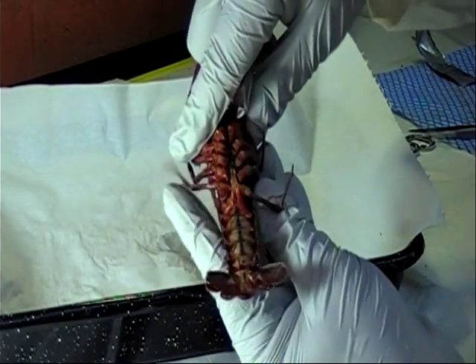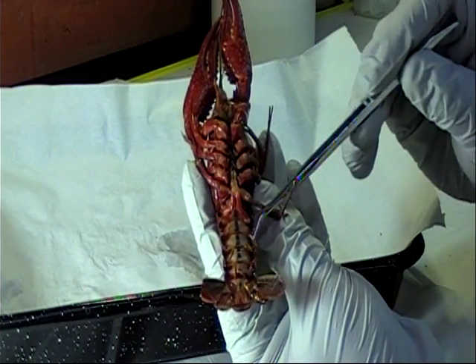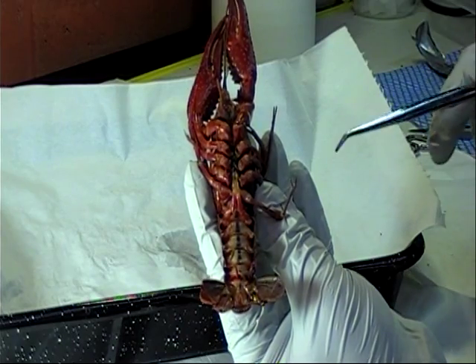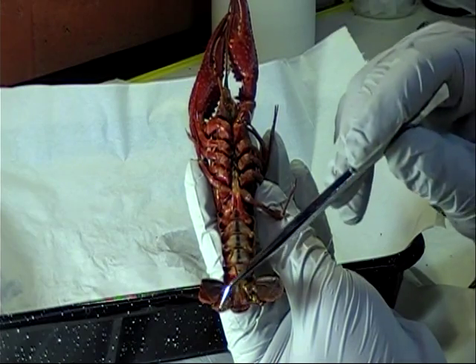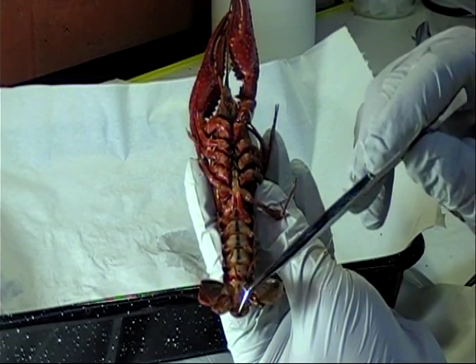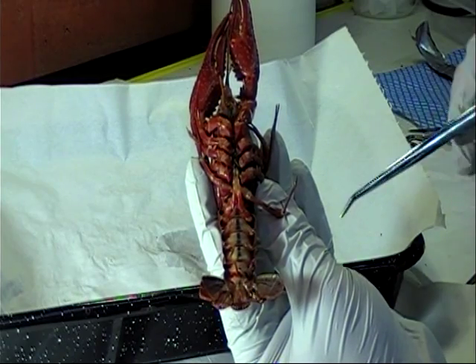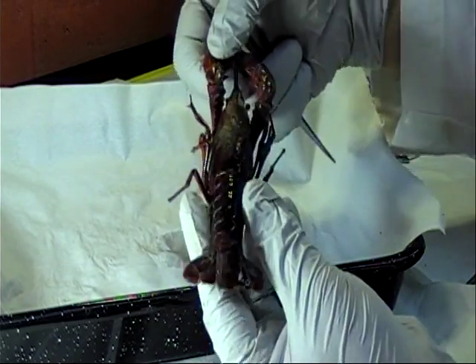Moving on now to the abdomen, we can see the segments of the abdomen contain swimmerettes, which are used to create currents and help the crayfish swim. On the last abdominal segment, there is a pair of pointed appendages modified into a pair of uropods, with a triangular-shaped telson in the middle. This is where we find the anus. The uropods with the telson make up the tail fan, which is used to force water forward and help the crayfish swim backwards.